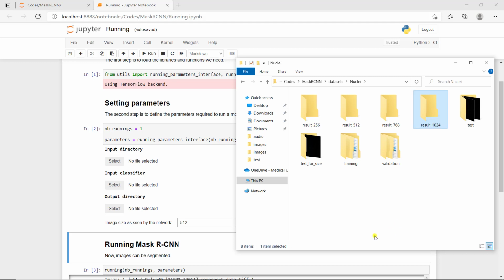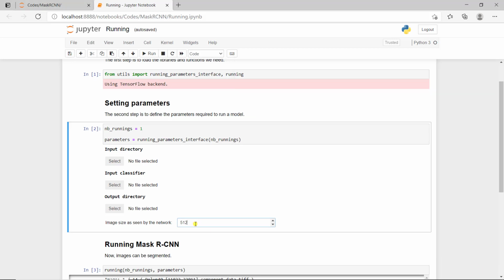So it's a bit misleading. It goes the other way around. When we define the maximum as 256, we're going to extract bigger nuclei. Just think about it. It's like you resize your image. So if your image is resized smaller, then it's going to look bigger.